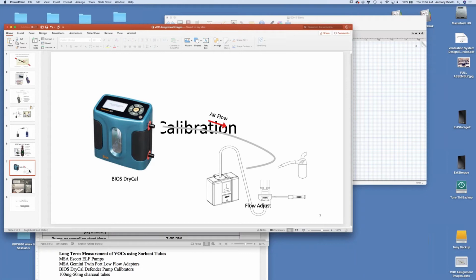And so for our purposes, we did some basic exercises where we set up a sample train and so forth. We didn't actually send out samples for results. In the lab description, we discussed how we would have simulated this using a sampling chamber.